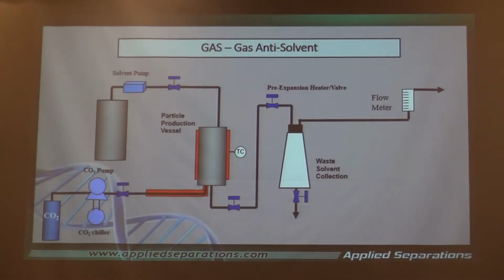Here's what we do first. Here's our solvent and solute. Remember, our solute is not soluble in CO2 this time. So we have it in solution here. How are we going to make particles? Now, what we wind up doing, we pump it in, a small amount. Then we bring in the CO2.